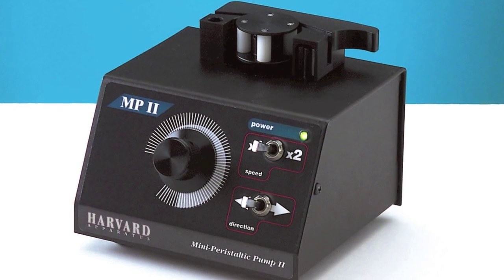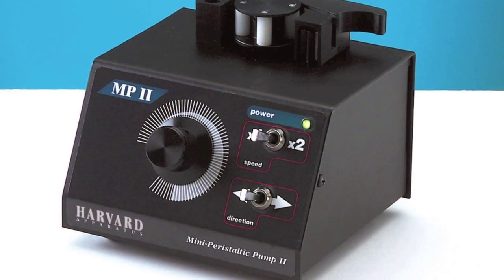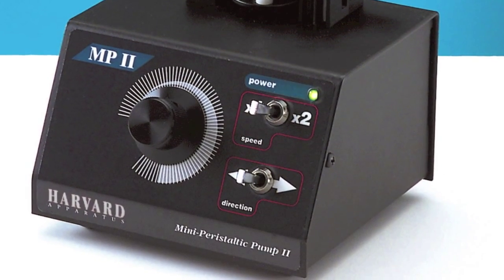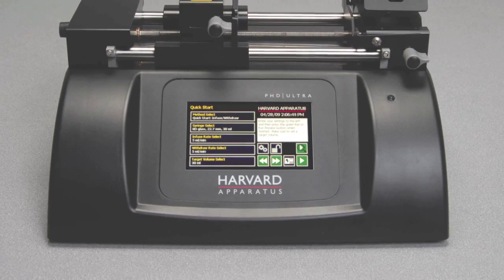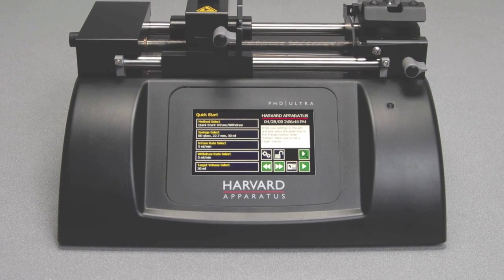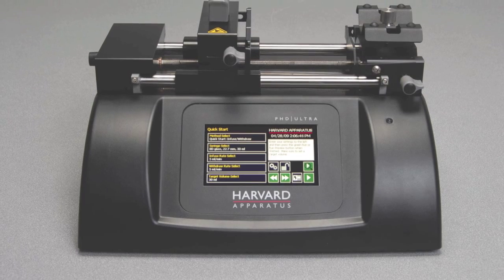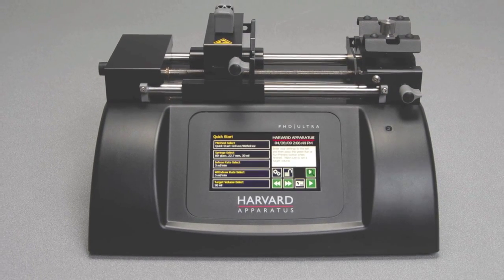Peristaltic pumps are also commonly used to drive perfusion since they allow for use of open-solution reservoirs, as well as allowing direct control of the perfusion flow rate. Syringe pumps are also useful for the direct control of flow rate and delivery of experimental solutions.